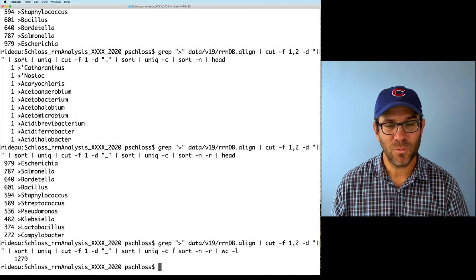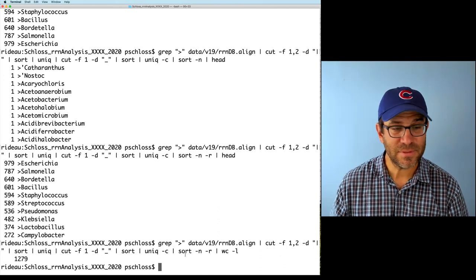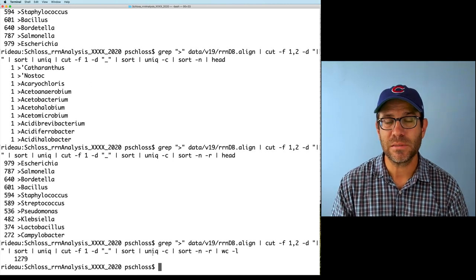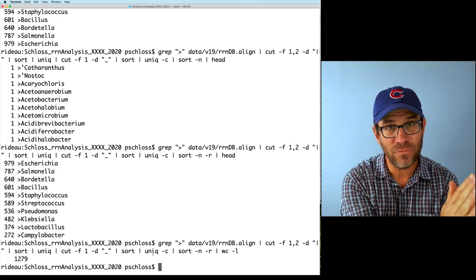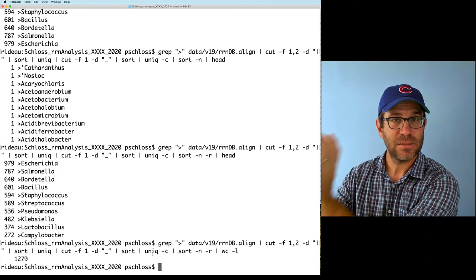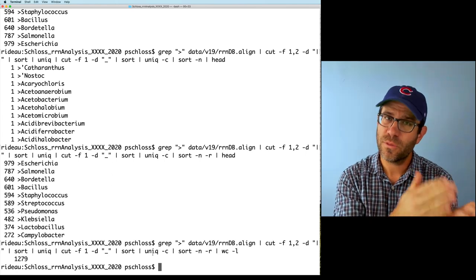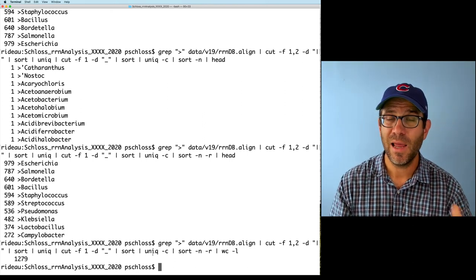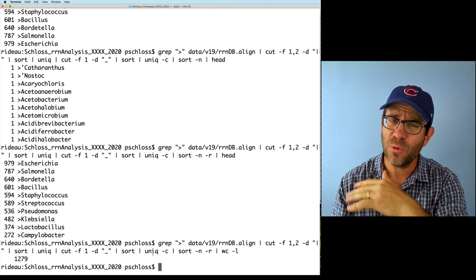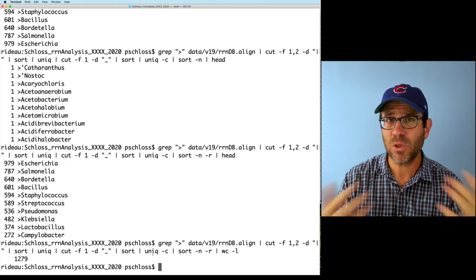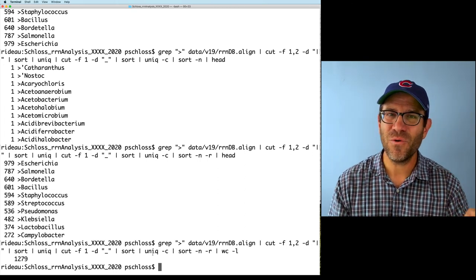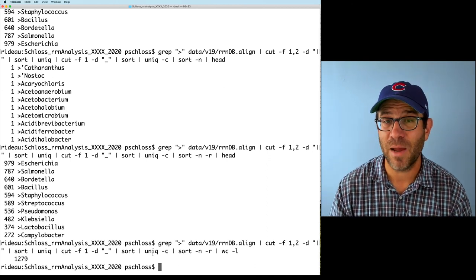Looking at the pipeline we developed, we used cut twice, sort three times, and unique two times. There's no rule saying you can only use these functions once. What we're doing with the pipe is sending data from one function — grep, into cut, into sort, into unique — and each step of the way we're getting closer to the answer. As you saw me develop this pipeline, at each step I'm using head or outputting data to the screen to see what's going on, and that's what I encourage you to do.